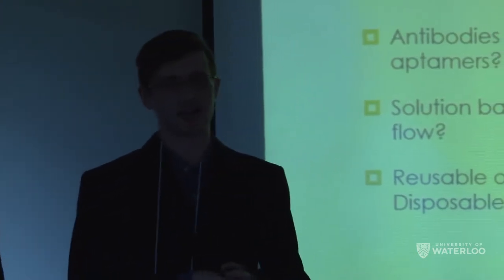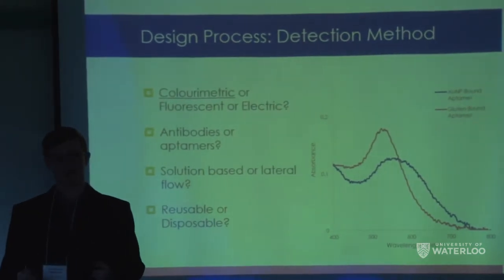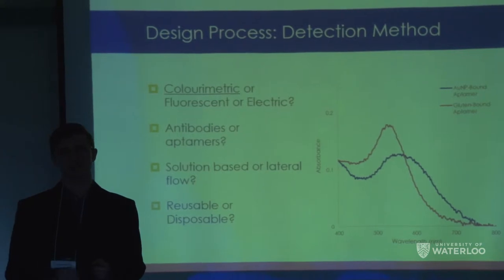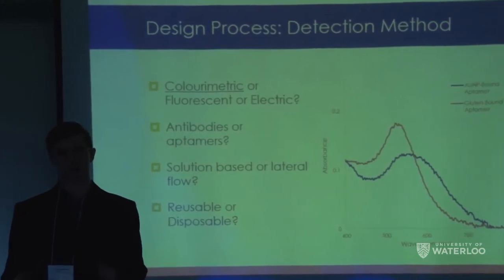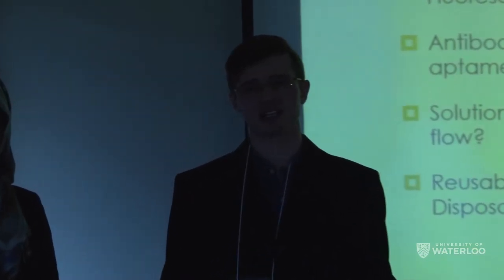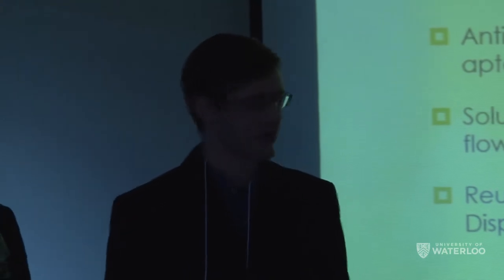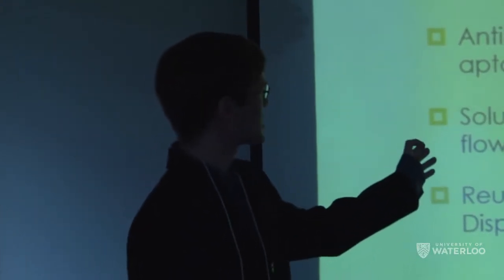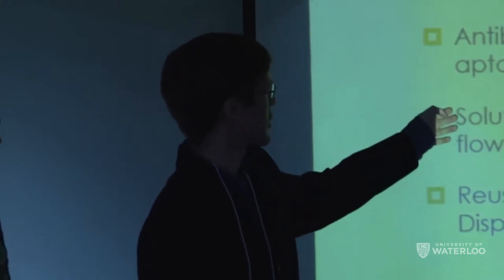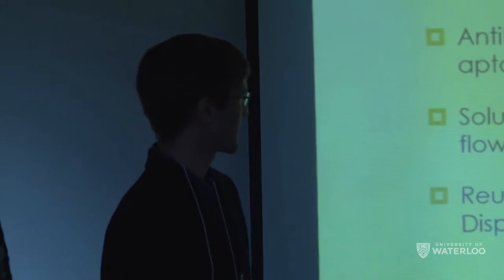So we went with a colorimetric detector. Colorimetric has the great advantage of requiring no extra hardware to use. Electric detectors would require you to have some sort of power source, and fluorescent detectors require you to have a source of UV light, whereas you can just observe visually the change in a colorimetric process. We've included two different spectra that you might see in a colorimetric device, and they're colored according to what the spectra would actually give you. So it's easy to discern by the naked eye.